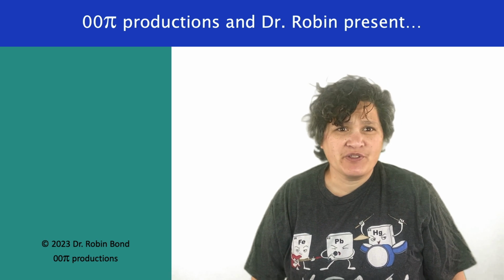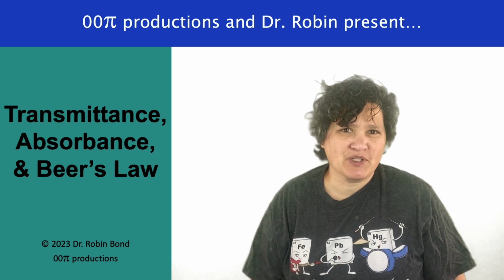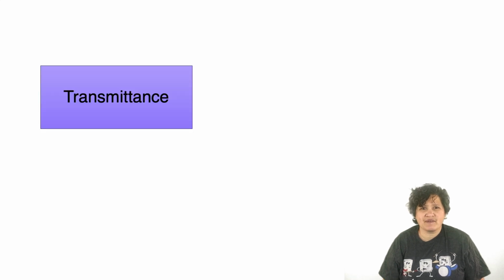In this video, I'm going to give you a brief introduction to Beer's Law. Specifically, I'm going to be talking about the application of Beer's Law to UV-Vis spectroscopy, but just so you know, it also applies to other sorts of spectroscopy, like infrared. Before we get into Beer's Law, you need to understand the difference between transmittance and absorbance.